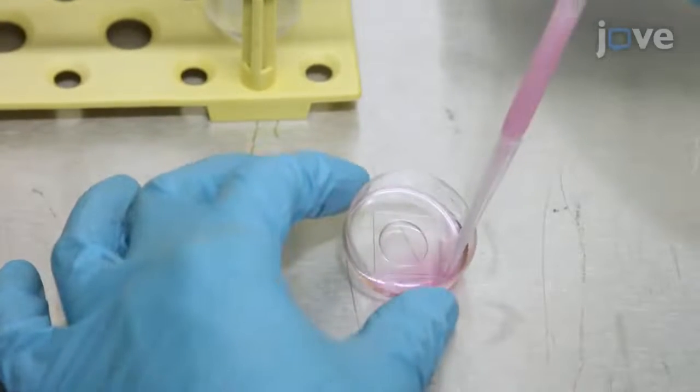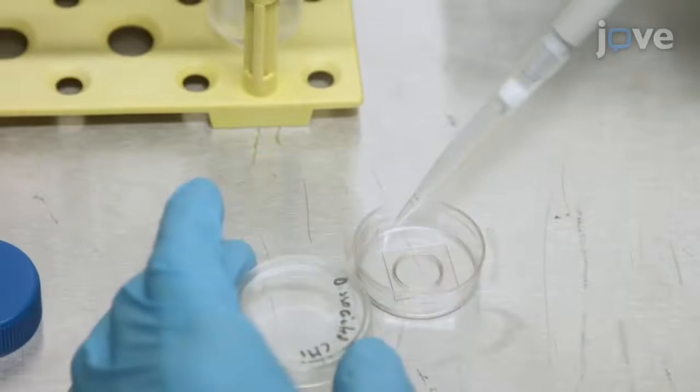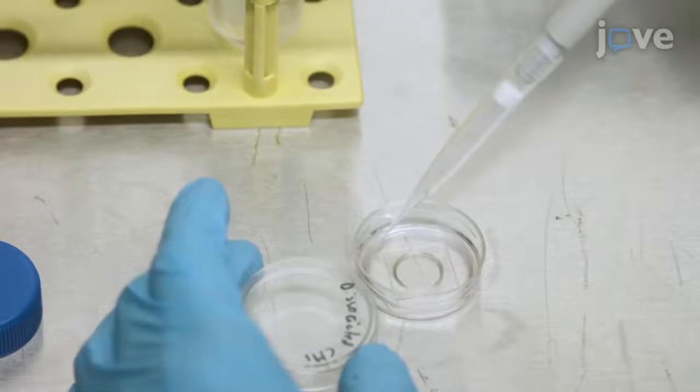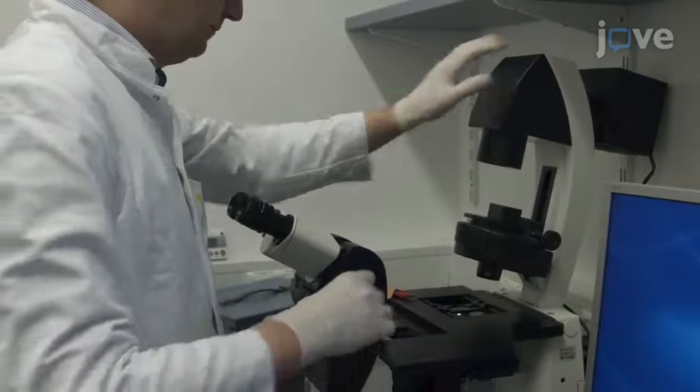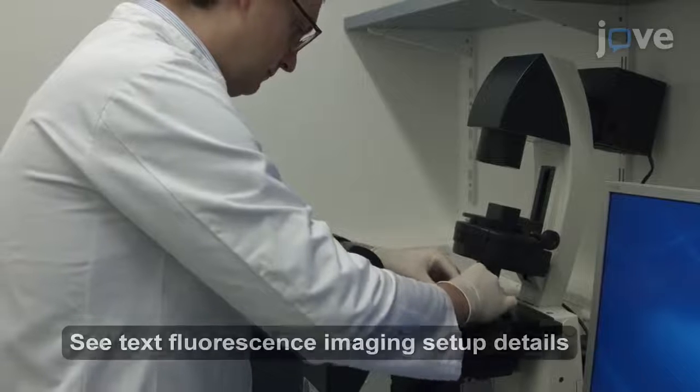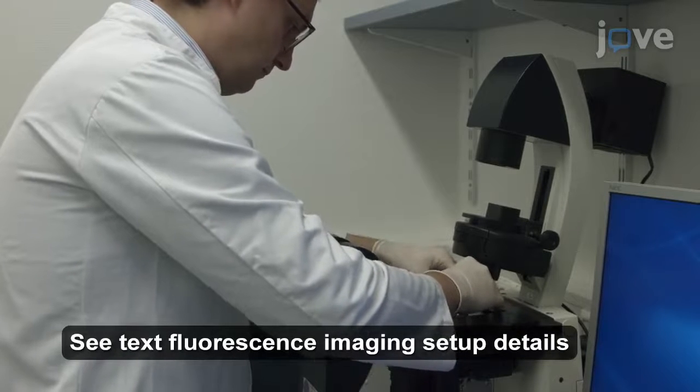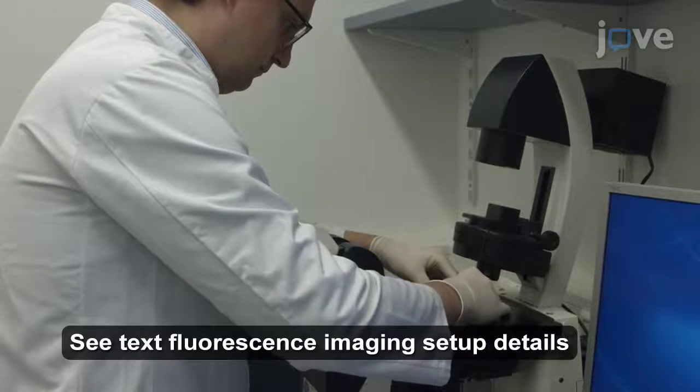Before imaging, exchange the cell culture medium with Tyrode solution supplemented with calcium and place the cardiomyocytes in an imaging chamber on the stage of an inverted epifluorescence microscope equipped with an image splitter.